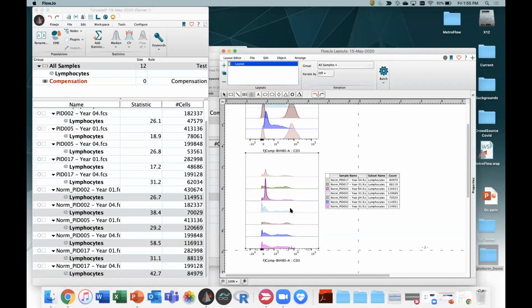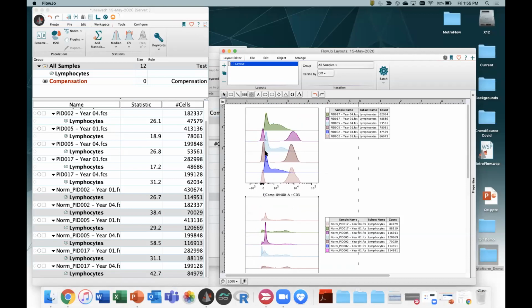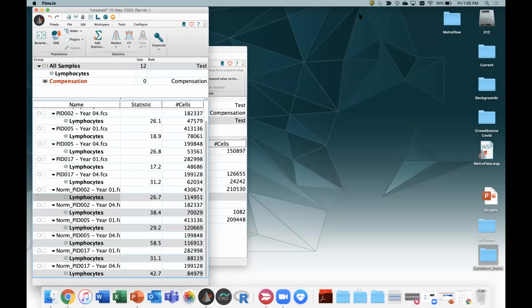And so it can take out something that's just, oh, it looks like this entire distribution sort of matches what that distribution has, and it's just more condensed, and normalizes for you. Okay, so that was the end of what I wanted to demo. I see there's at least one question here in the chat.